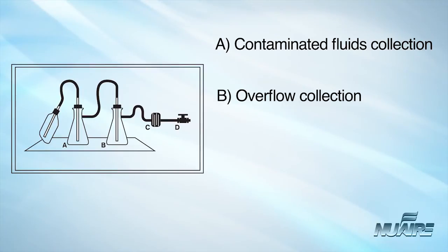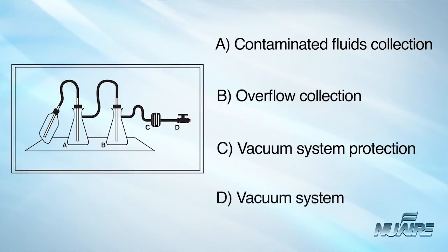A glass sparger in flask B minimizes splatter. An in-line HEPA filter, C, is used to protect the vacuum system, D, from aerosolized microorganisms or contaminated liquids.